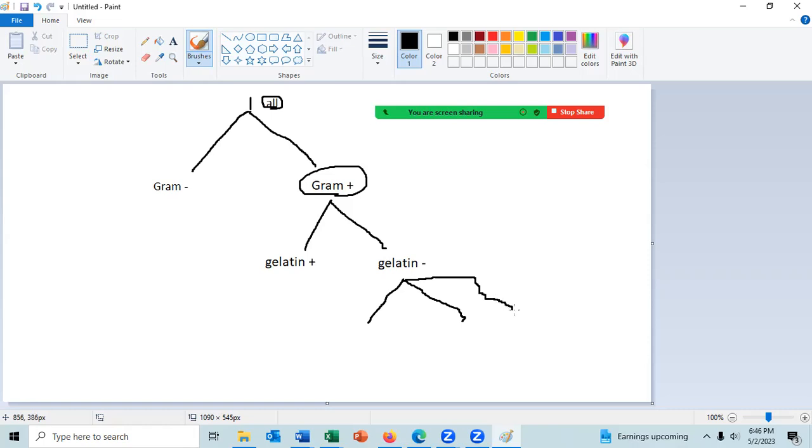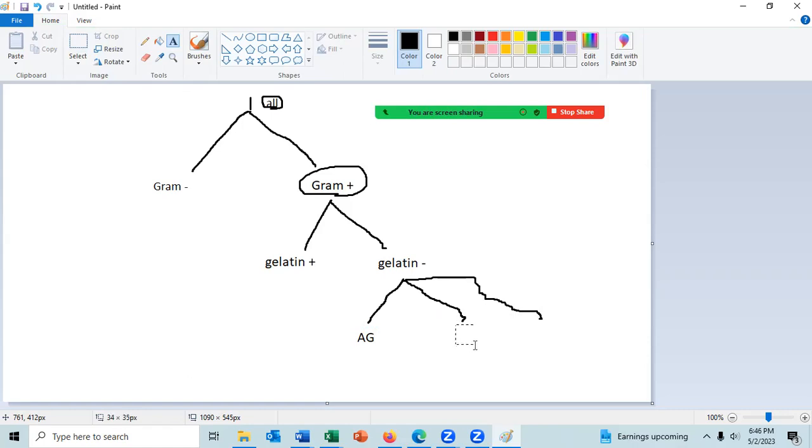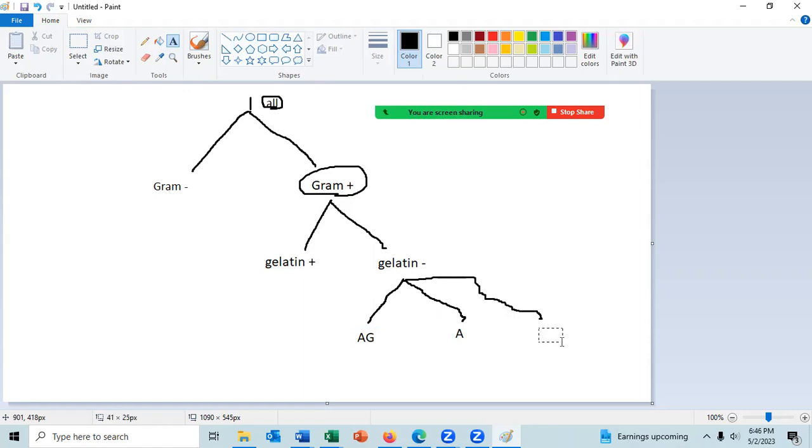Sorry, I'm not doing a very good job here. And that is, for PR lactose, you can have AG, A, and then negative.